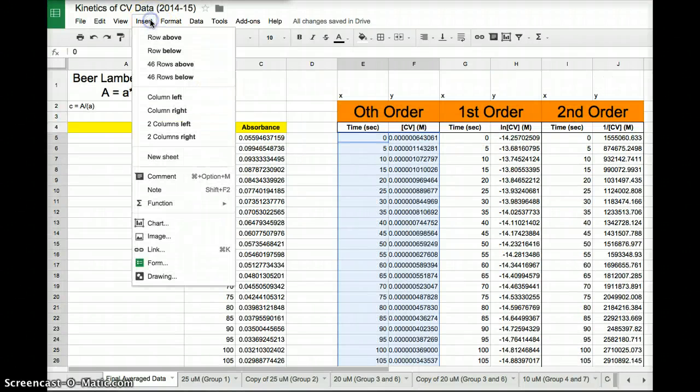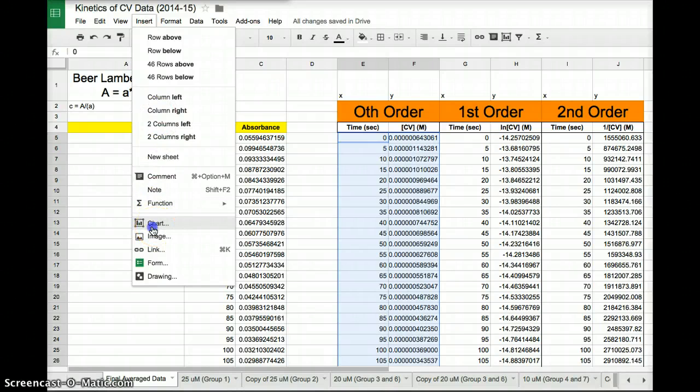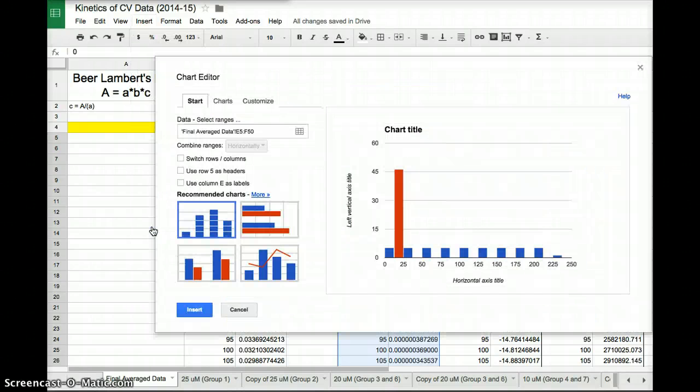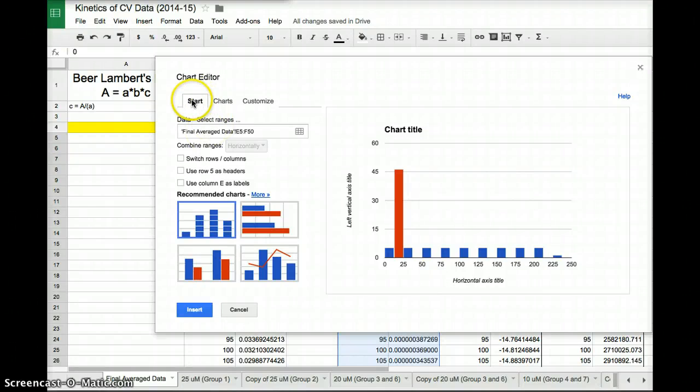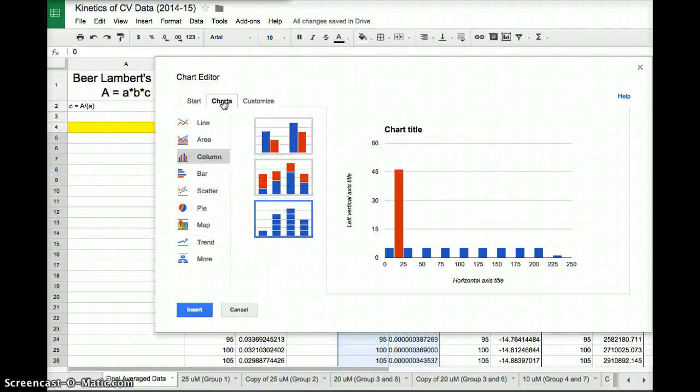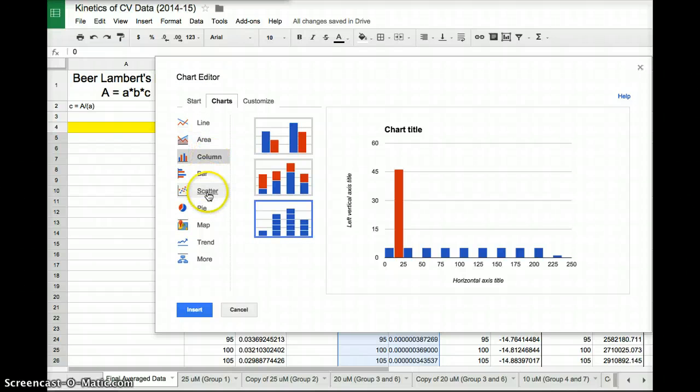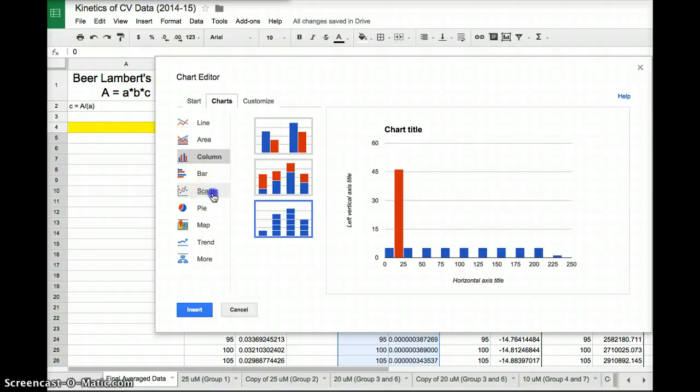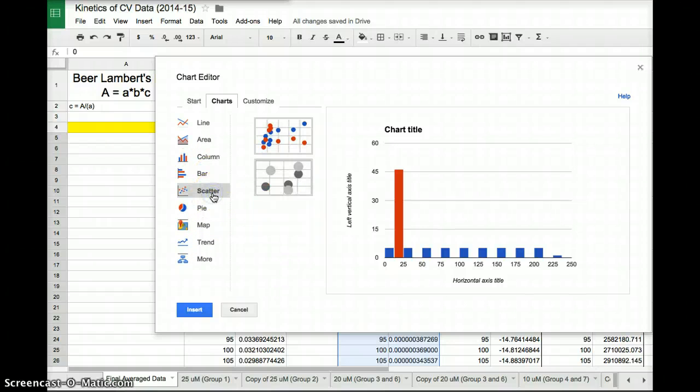I click insert, chart. Now I have all these options of types of graphs that I want. I click charts in the middle. Do I want a line, an area, a column bar, scatter, pie? There's so many options. What we want is we want a scatter plot. We want to just put all these data points onto the graph.